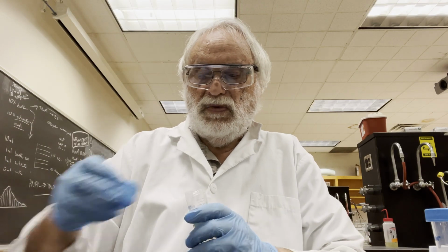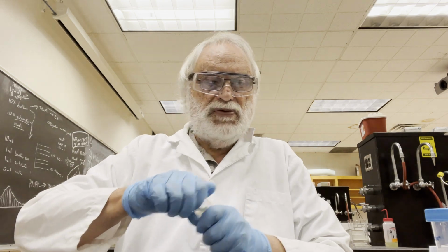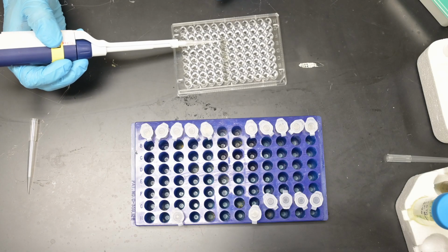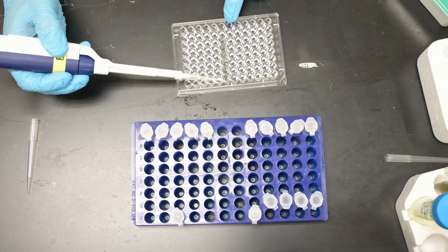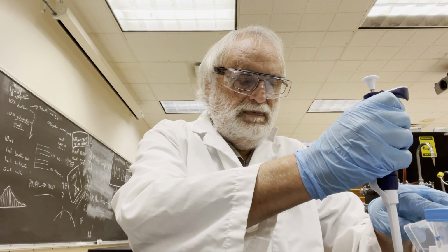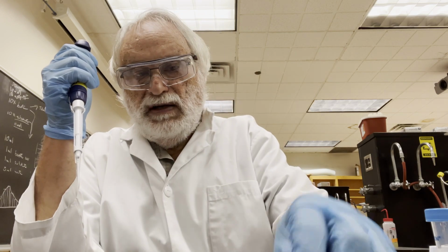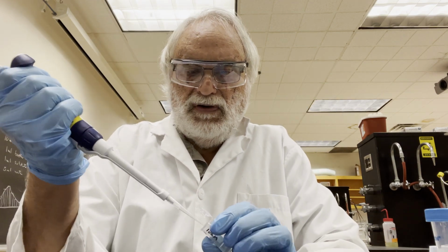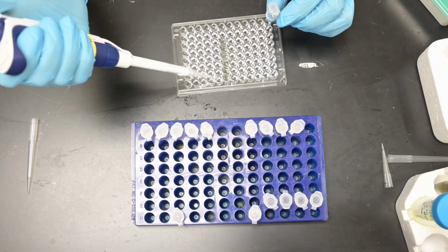Okay, so we now have 6 samples loaded of the 20 millimolar substrate. So this is the 20 millimolar substrate section. Next, we'll do 10 millimolar, which is the first tube from our serial dilution. And what I'll do is I'll lay these out on the plate.